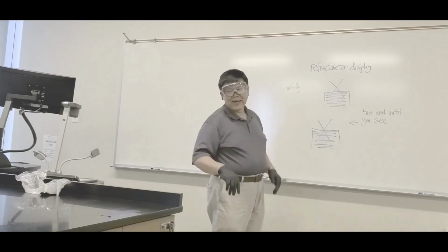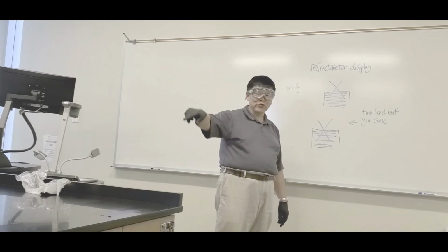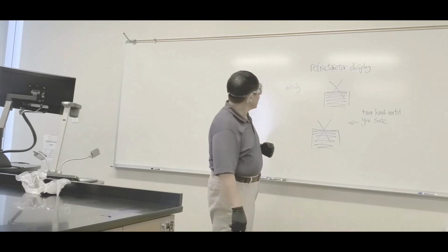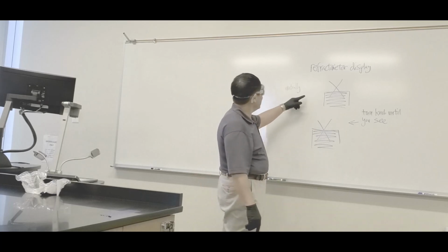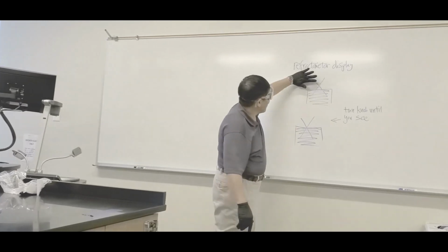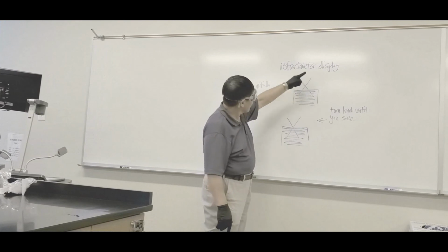All right, class. I got used to the board because the camera couldn't look into the scope. When you look through that scope, what you'll see initially is something that looks like this. There's a dark black area, then there's a white area right there, and this is what I call the interface. And then there's an X, the crosshair.